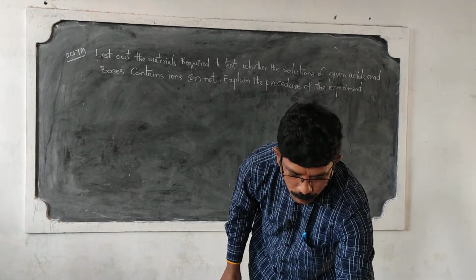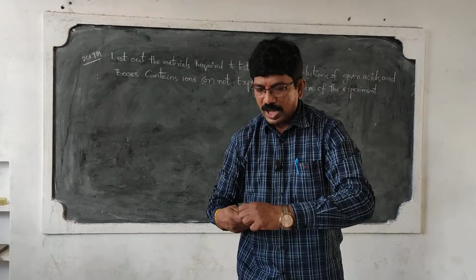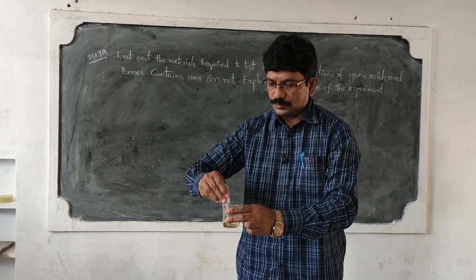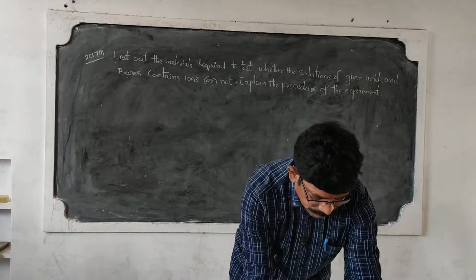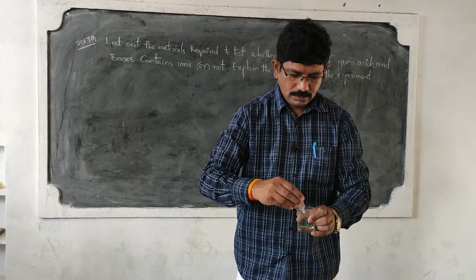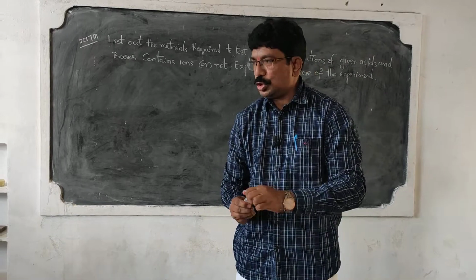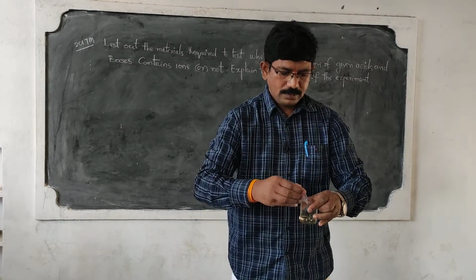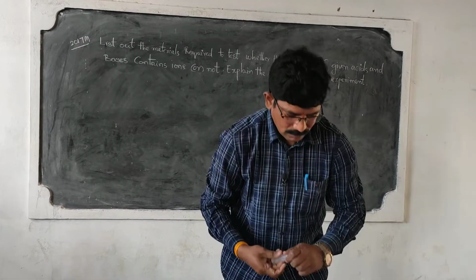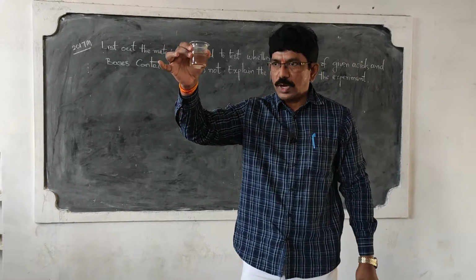First of all, you have to prepare the solutions of different acids and bases. This is the pure water. We call it distilled water. First, prepare different solutions. This is the distilled water solution, means pure water.